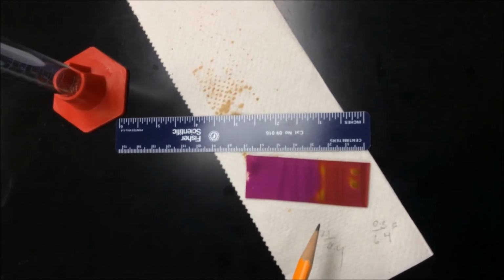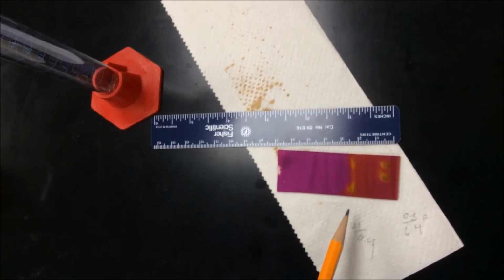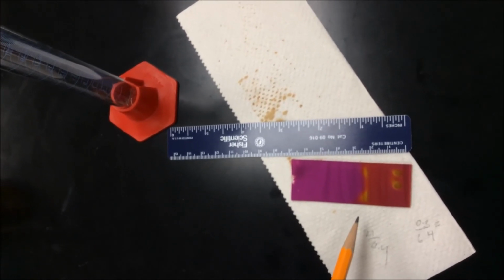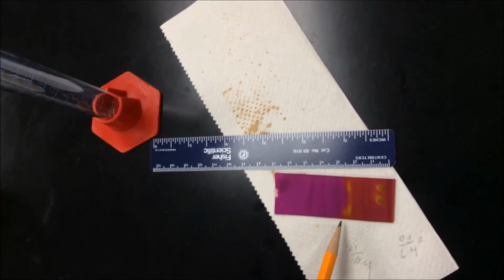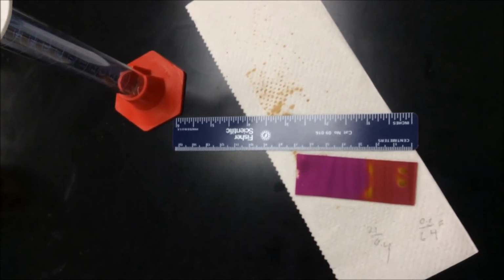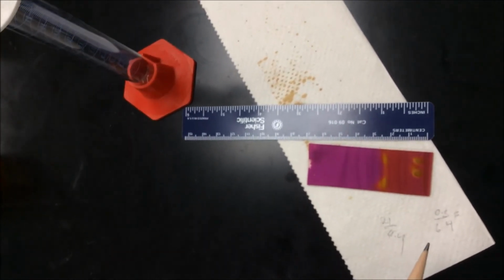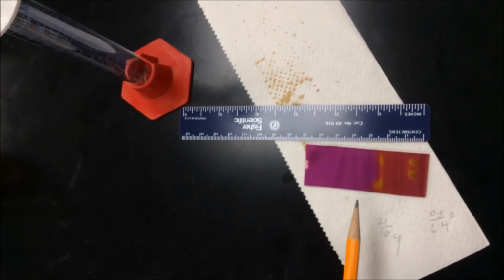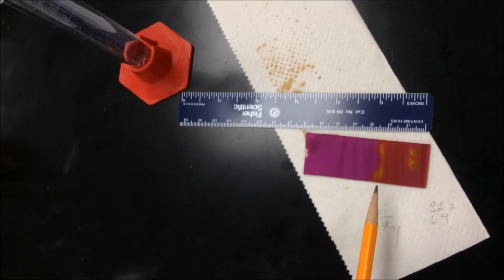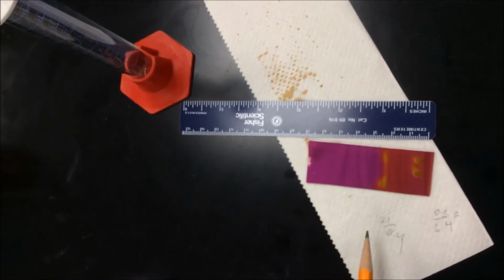And understand the power of this technique. If you're running a reaction and you don't know whether the reaction has gone to completion or not, you can simply take a TLC in the middle of the reaction and be able to tell for yourself if you're seeing a new spot of the product or not. And so you don't have to run the reaction 1200 different times. You can actually monitor the reaction as you go and be able to predict whether the reaction is complete or not. So TLC is a very powerful analytical tool for us to be able to determine what's going on with the reaction.